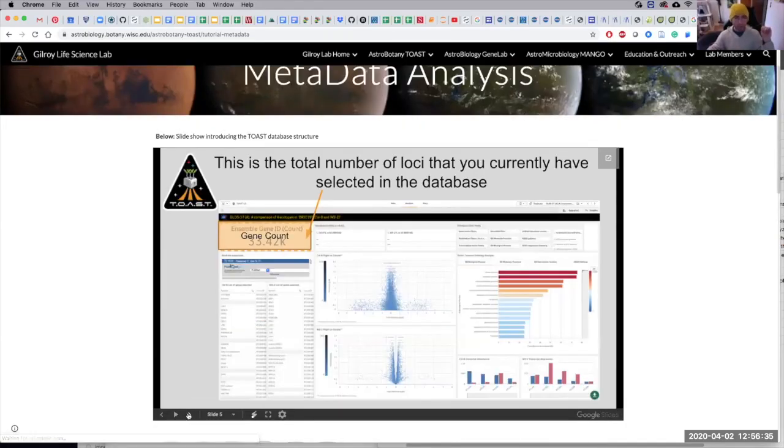Okay, cool. So we're going to start to play with dashboards. Dashboards will basically function the same, but I like to have KPIs, key performance indicators, in a corner. So this thing here is counting how many genes are currently being selected by the database at that moment. And then those genes that are selected are shown on these graphs. And then the function of those genes is then displayed on the side here. And then the statistics can be pulled in.